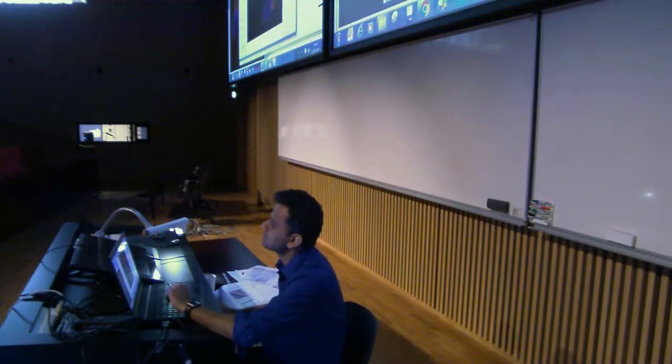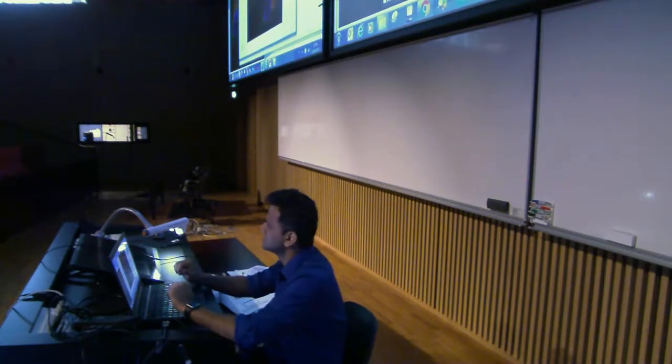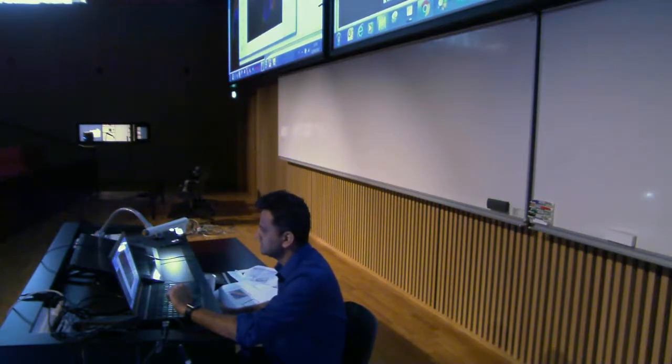I'm telling the computer that these sets of pixels belong to one class, likewise for 3 classes, and just asking the computer to do it. And now it's doing all this exhaustive machine learning stuff. So it's training a model. But this is a one-time procedure.